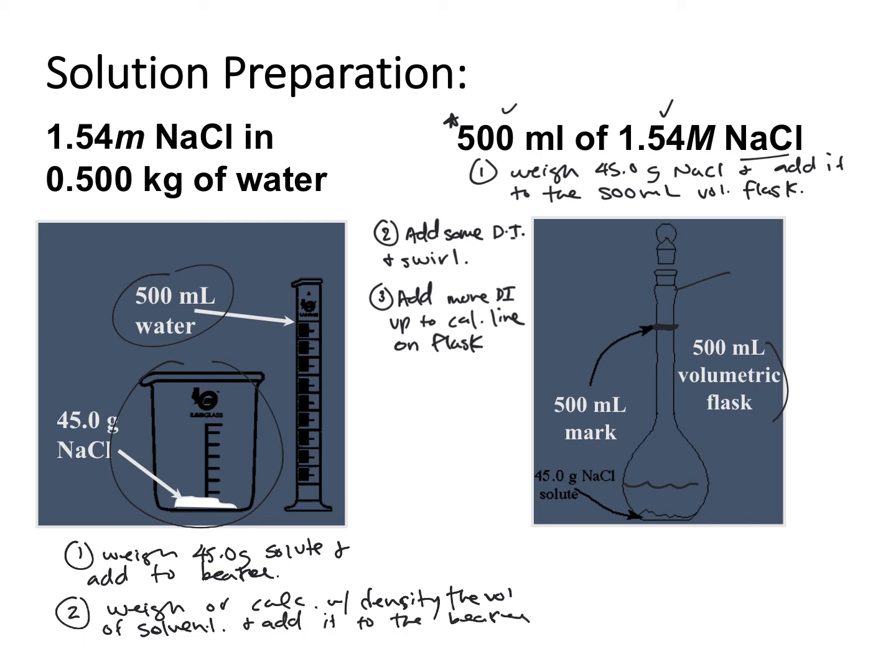Okay, then swirl. Okay, now your solvent is, in this case, water, okay? And in the case of water, I will never give you the density of water. It's assumed that you know, but if it's a different substance, then I will tell you that specifically. Okay, so this is just simple solution prep. Make sure that you're comfortable with the steps. Anytime you're saying you're adding water, please make sure that you're being specific that it's deionized water.